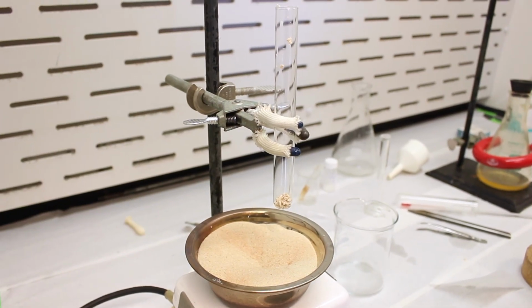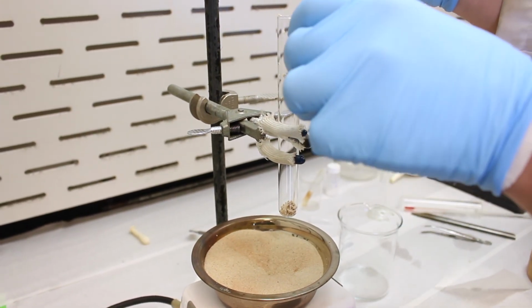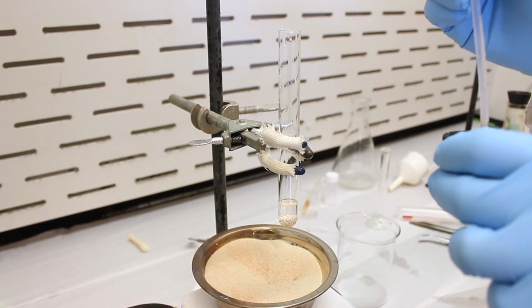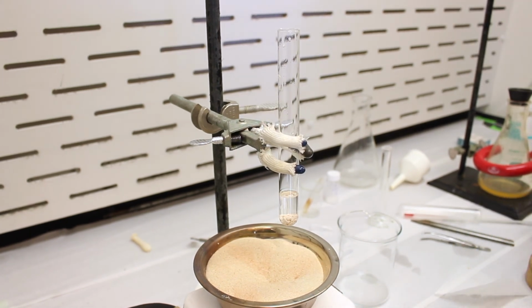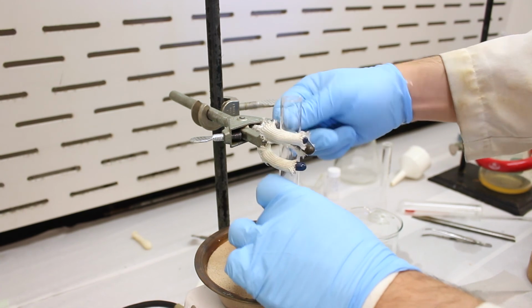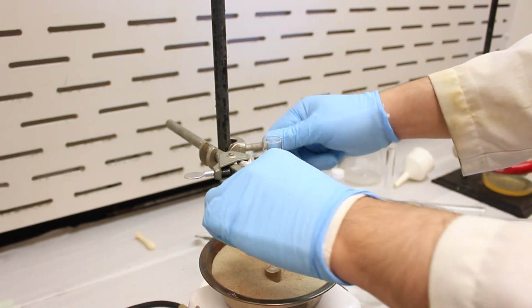Alright, so we've got our solid inside the test tube ready to go, and I'm going to get some ethanol here to dissolve it. So we'll start with about 2 milliliters, so let's try to rinse down solid here. Okay, a little bit more. So I'd say that's about 3 or 4 mils. And what we'll do is we'll take this and put it back into the sand bath to gently heat it until it dissolves, and once it dissolves we can let it cool slowly and we should form some nice crystals.